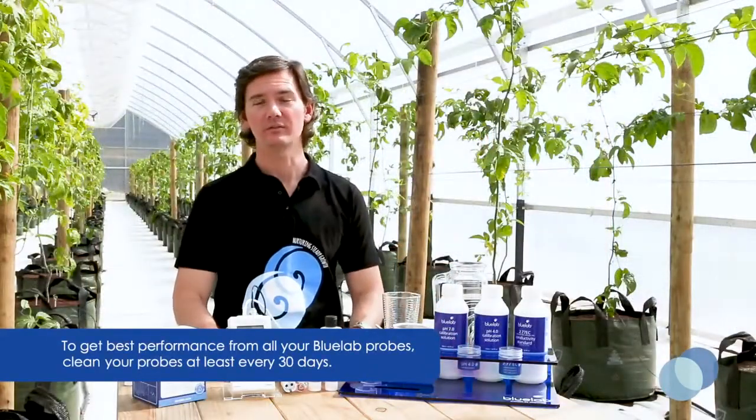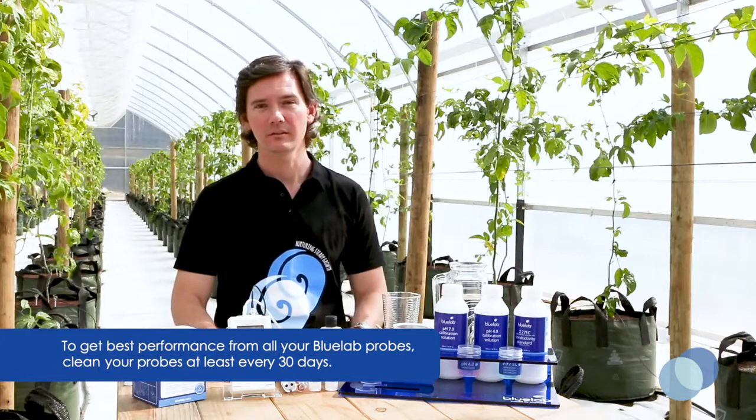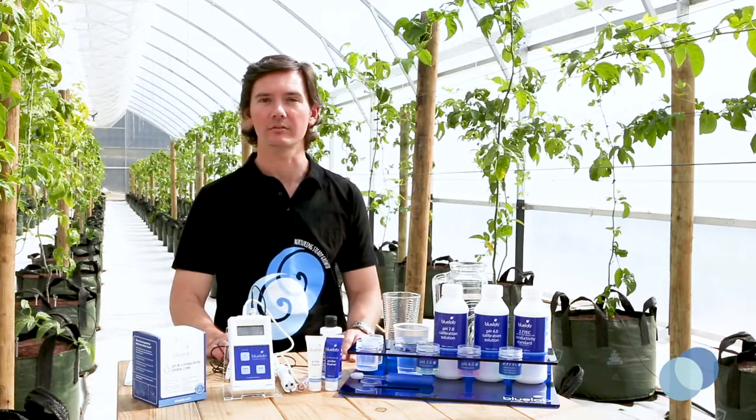Hi, I'm Matt from Blue Lab and today we'll be sharing how to clean and calibrate Blue Lab's combo meter. To get the best performance and accurate readings, you'll need to clean your probes every 30 days. You'll know it's time to calibrate when the calibration indicators have disappeared from the combo meter screen.